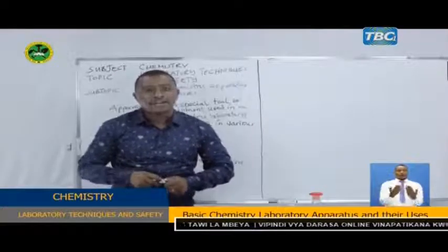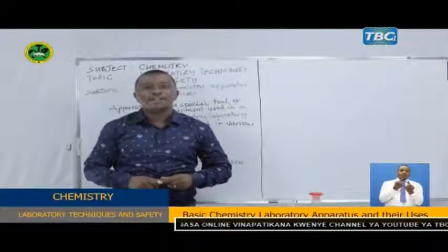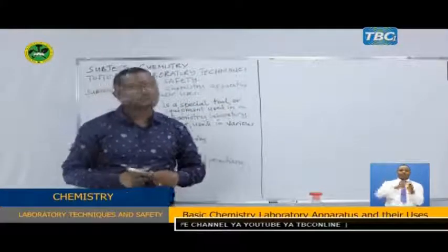Now class, today we shall also be discussing the classification of apparatuses used in the laboratory.